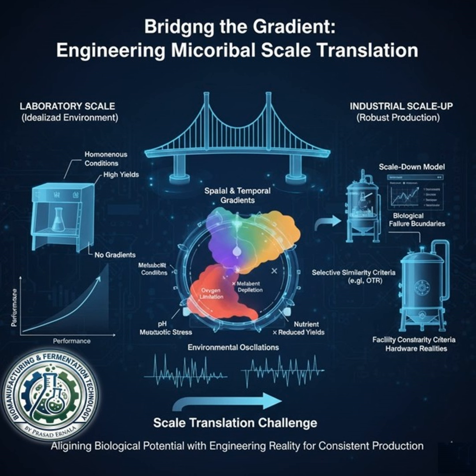I was really struck by that detail in the source material about how a sensor itself can lie to you in a thick broth. Oh, yes. In very viscous fermentations, like some yeast processes, the broth can get over 50 centipoise. It's thick. And a stagnant liquid film can actually form right on the surface of your dissolved oxygen probe. So the probe isn't even seeing what the cells are seeing in real time. It can't. The film physically slows down oxygen diffusion to the sensor.